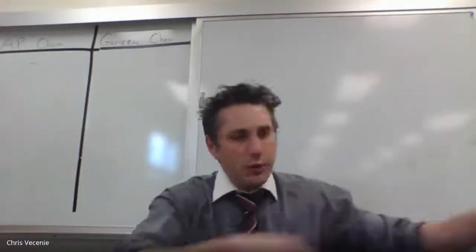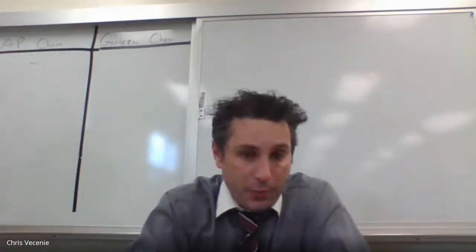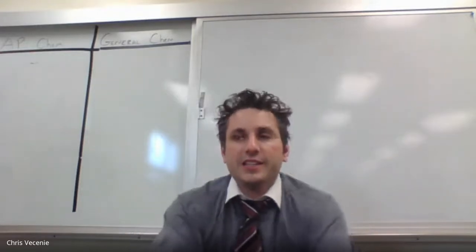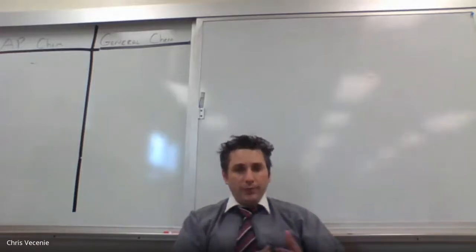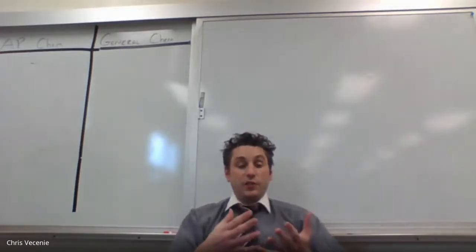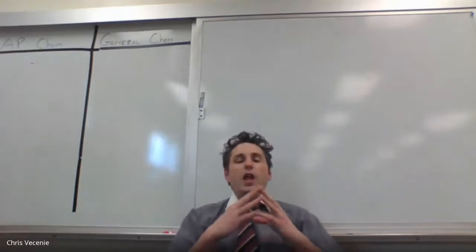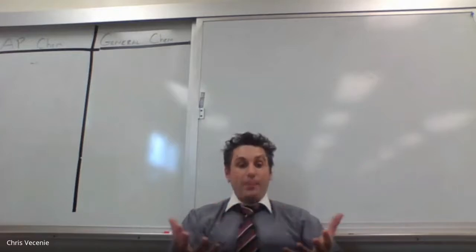Hey guys, so for those of you at home, if you were with me for the pre-lab, you know what you should be doing. The idea is that I want you to predict using your note card what's going to happen in each of the reactions. Once you have them predicted, you're then going to watch the video to see what happens when we do those.